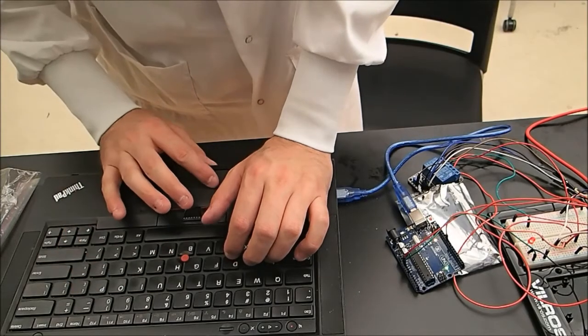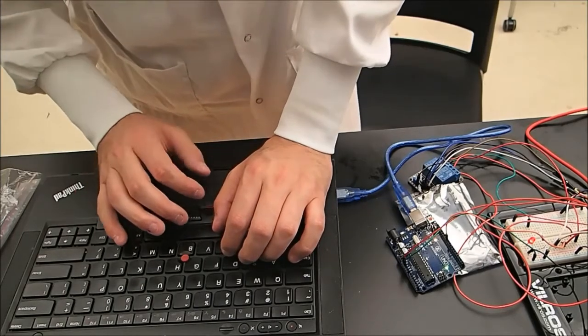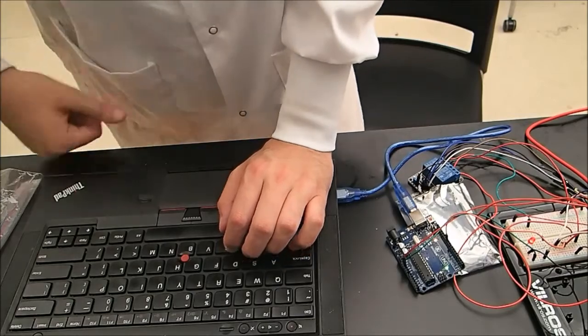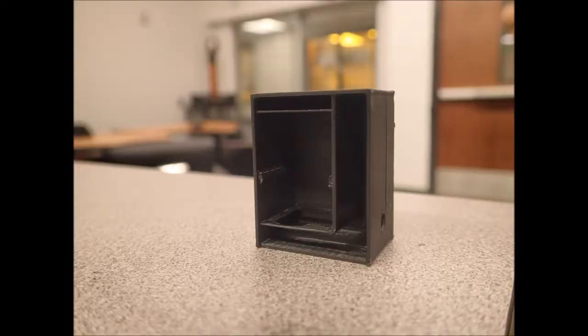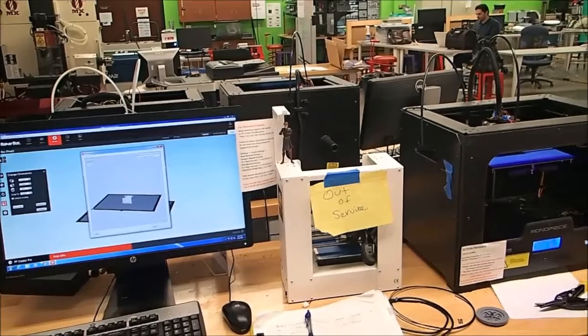In order to measure the levels of antigens in the samples, a backlight is required in order for the camera to pick up the changes in color of the samples. Here is one of the rough prototypes that we designed in the lab to test the automated heating function and the effectiveness of heating. This is a sample-sized box we designed in the early prototyping stages to verify the effectiveness of 3D printing for our uses.